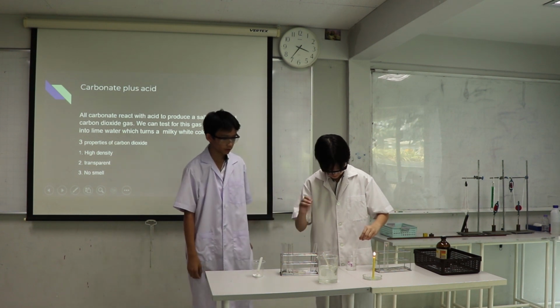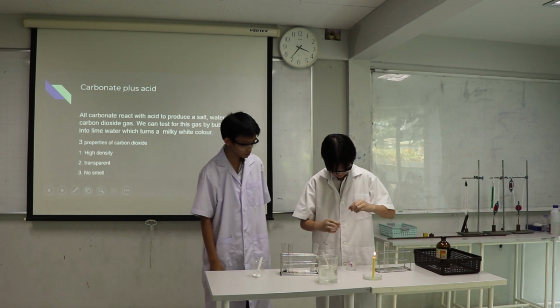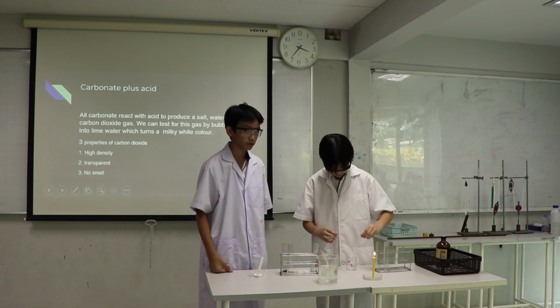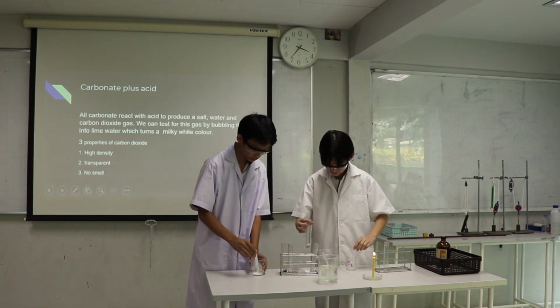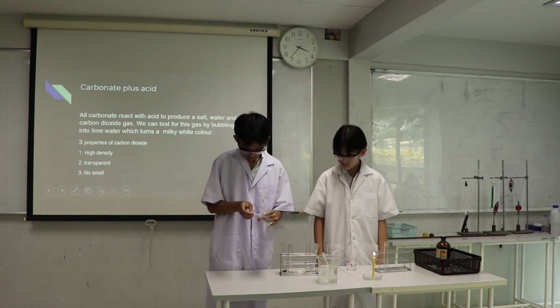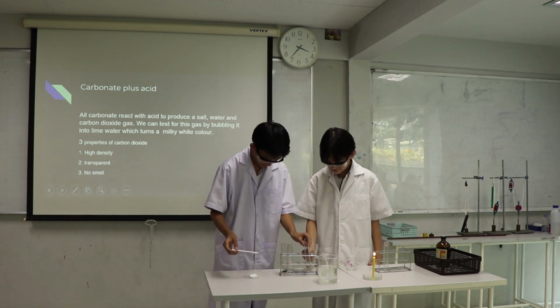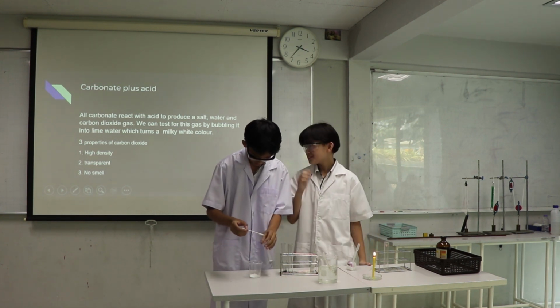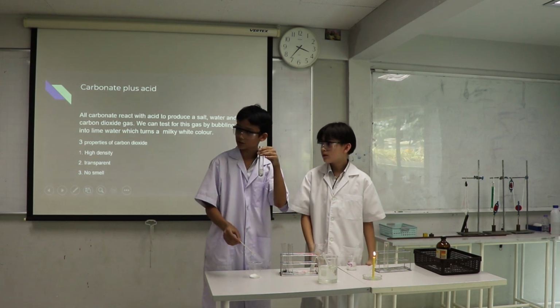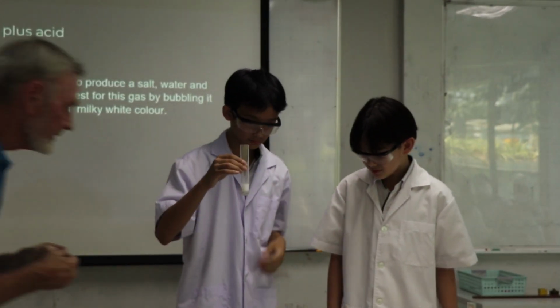Romeo here will be adding sulfuric acid to the test tube. So I'll say 9 mils of sulfuric acid. Now I'll get calcium carbonate. Not that much. Put it in the boiling tube. It makes a chemical reaction. Yeah, it's in here.